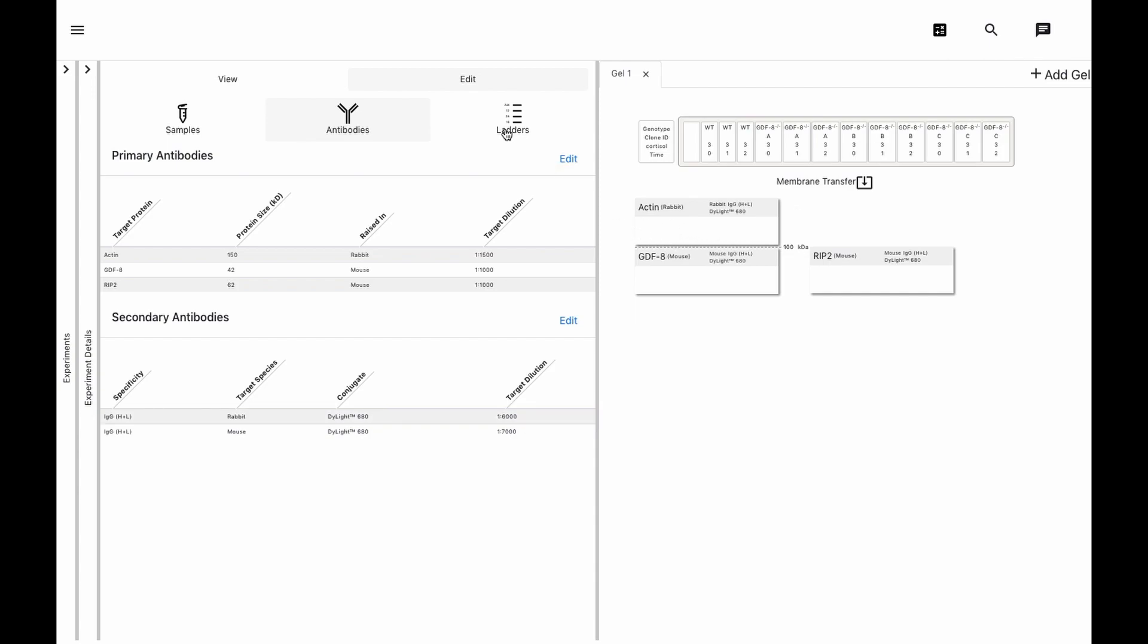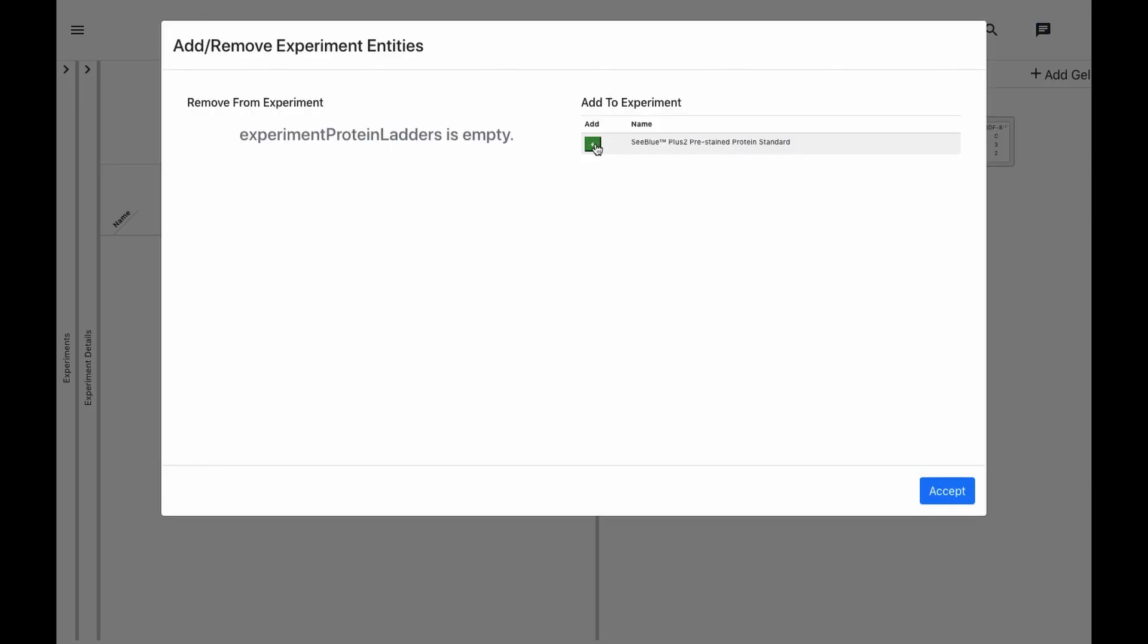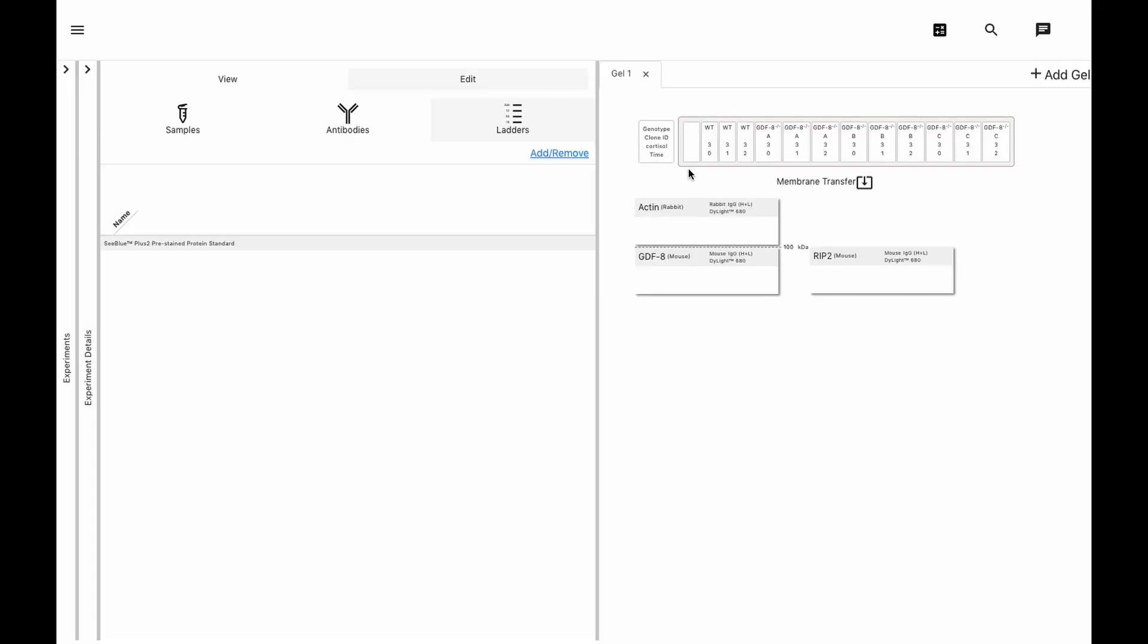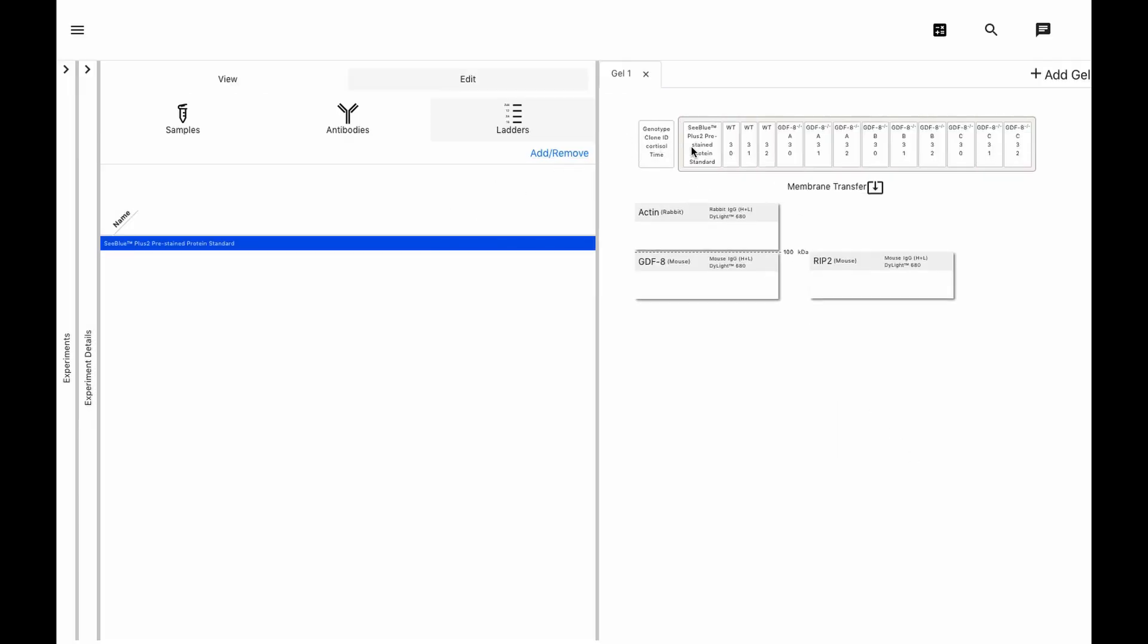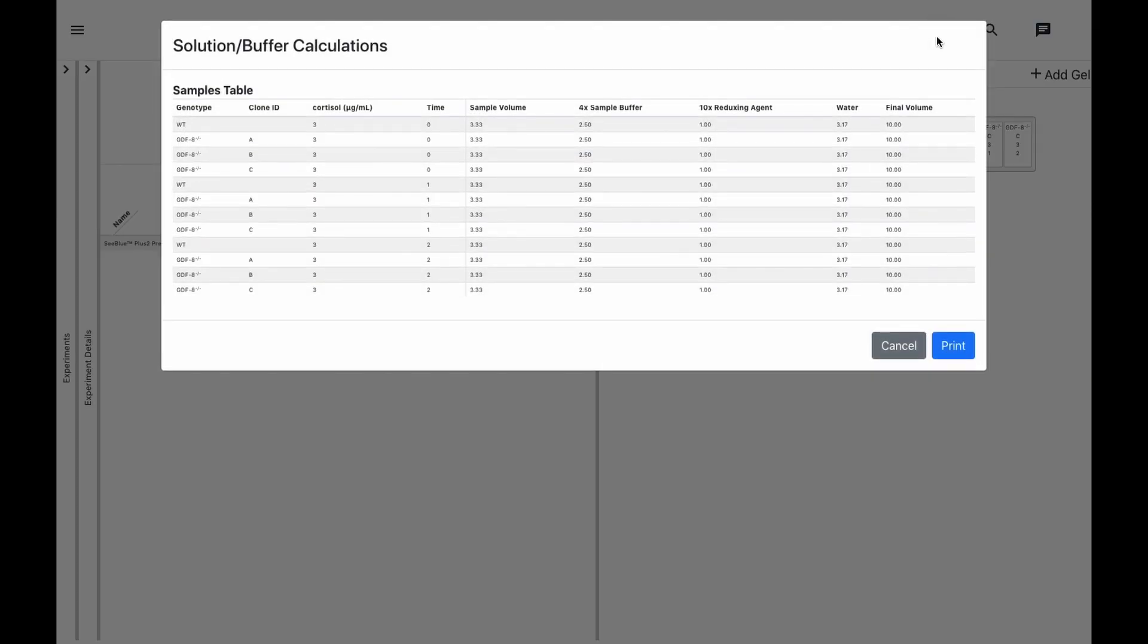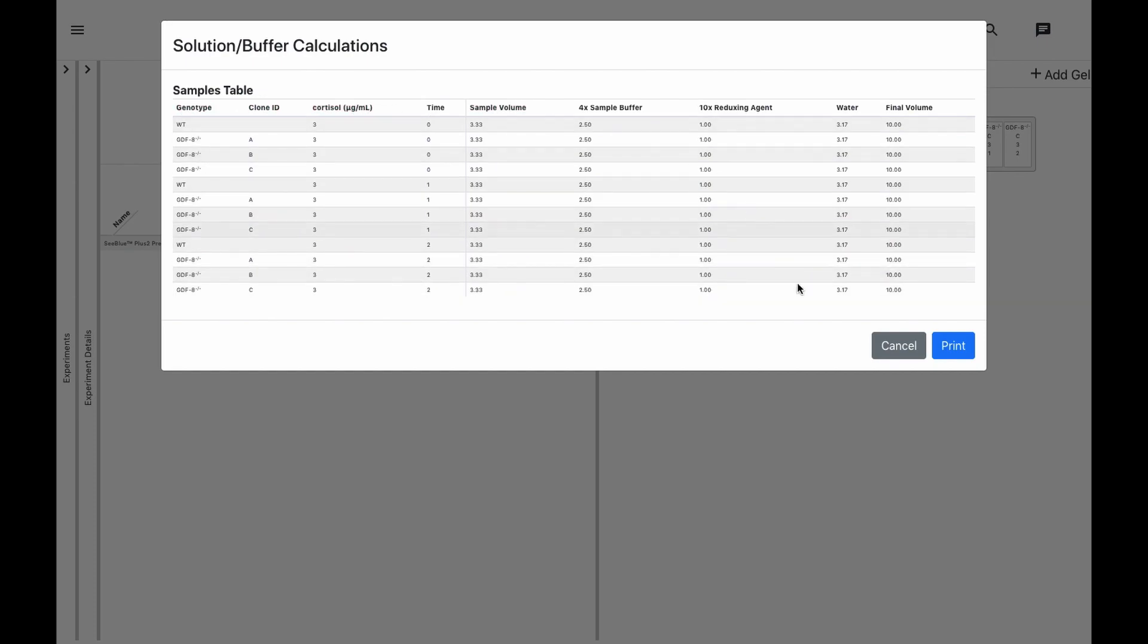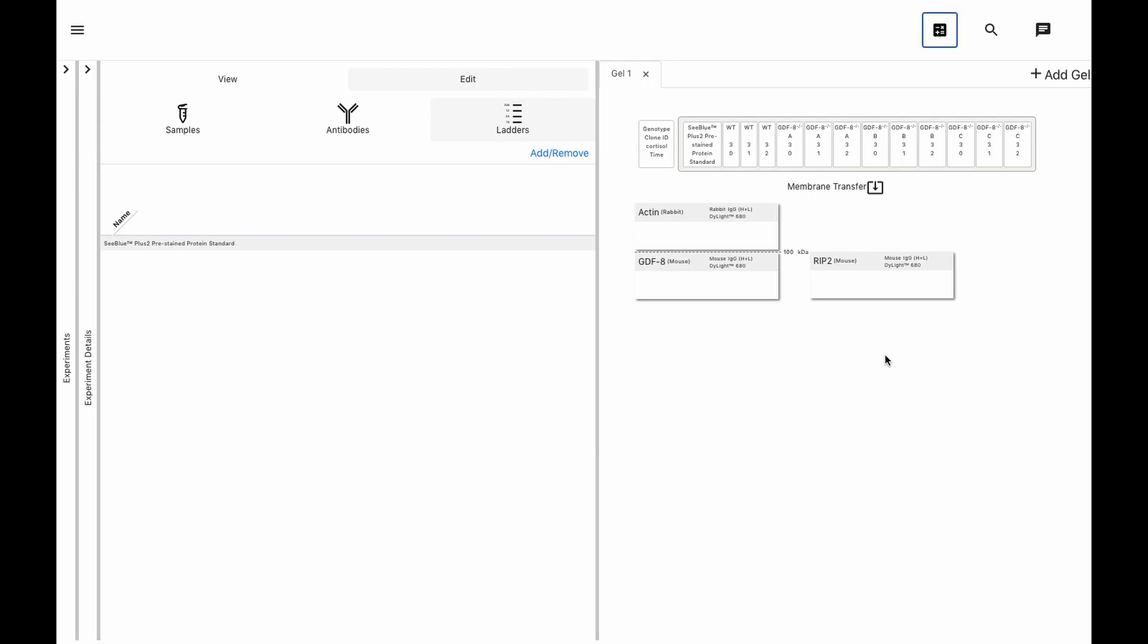Now we just map the protein ladder to its lane. All the calculations for setting up the assay based on the protein quantifications uploaded earlier can be found in this table here. The left-hand side specifies the condition, and the right-hand side specifies how to load the protein according to our loading specifications. And then we can take this, print it, and bring it right to the lab.